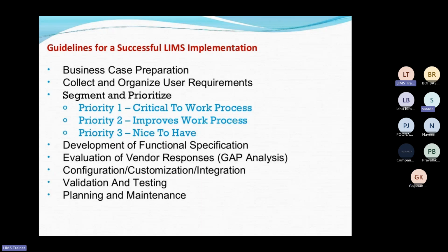And day by day, these roles are increasing. Why? Because all the industries are shifting from manual mode to auto mode. And why are they shifting? Because that is also a regulatory requirement, and because they want smooth operation in their laboratory. That is the main purpose. They don't want an auditor visiting their lab and getting some findings there. When the lab is operating with the software, there will be minimization of human errors.